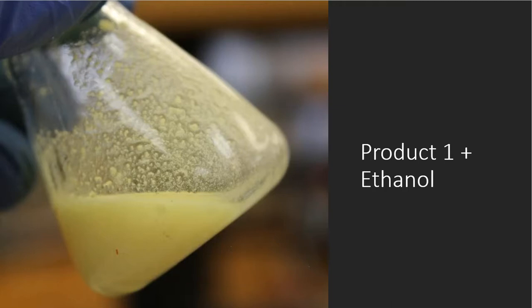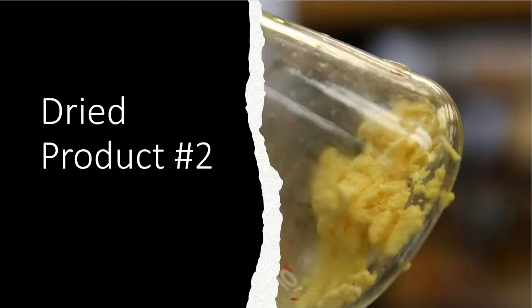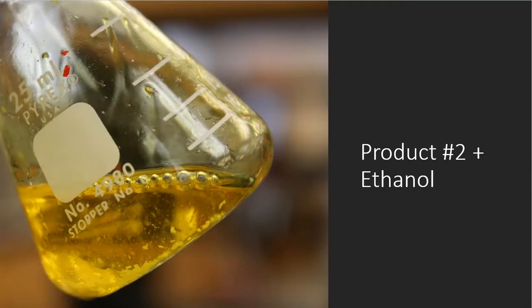All right, so I'll just set this aside, and I go and get the dried product from number 2. This is the methyl p blah, blah, blah. There's the dried product in the Erlenmeyer flask. I'm then going to add ethanol to it, and this is what it does. Look at that. That dissolved it much better, but it still did not fully dissolve. Still not happy with that either. Recrystallization is not going to take place.